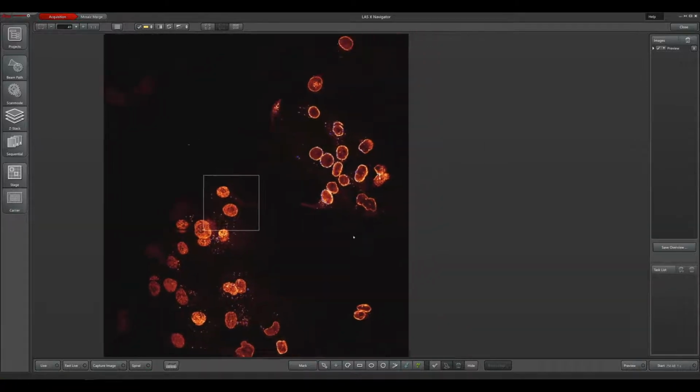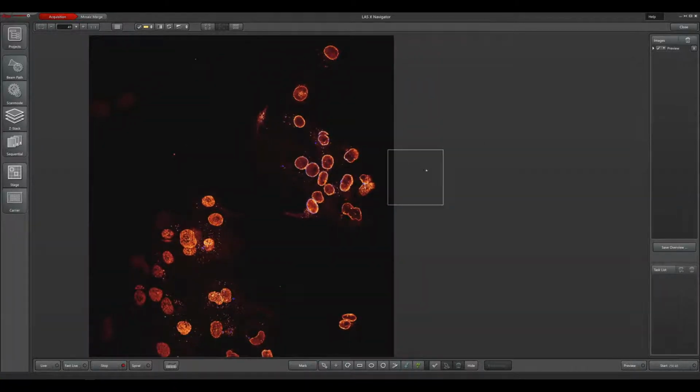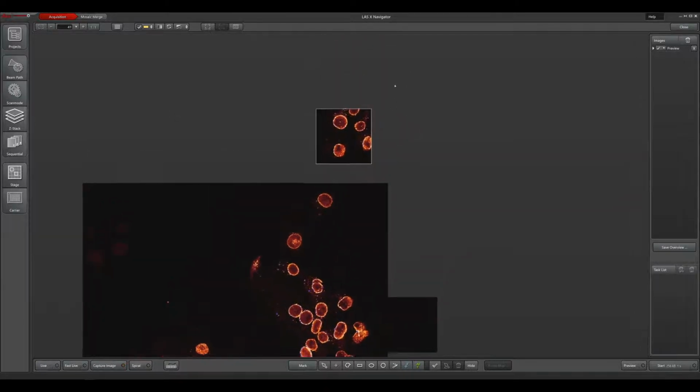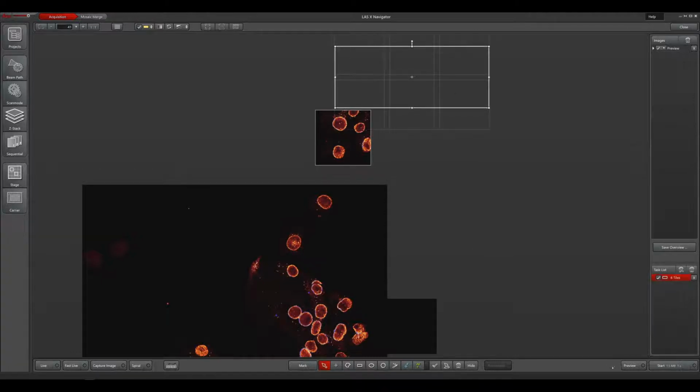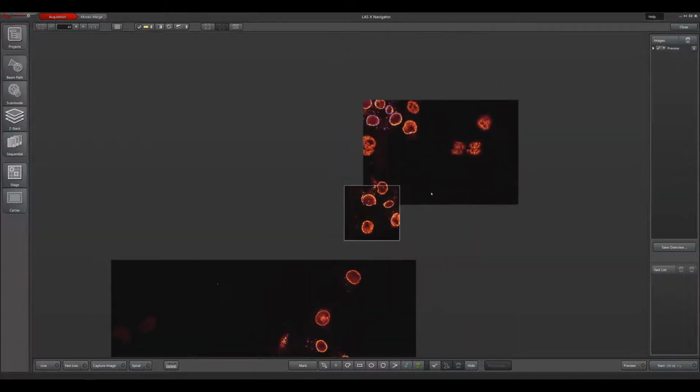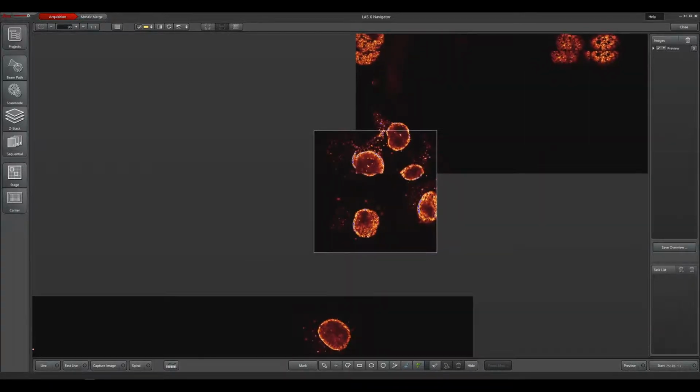And what I can also do, if I double click somewhere into the screen, the stage will move to that position and give me a preview of that area in the sample. And if I then see interesting regions over there, I can either do another spiral acquisition, or I can also mark a certain region that I want to get a preview of to see how my sample looks like in that corner. So I think we did find already enough interesting cells that we can now image with Tau STED. So let's maybe just stay here at this one, or let's pick this one over here.